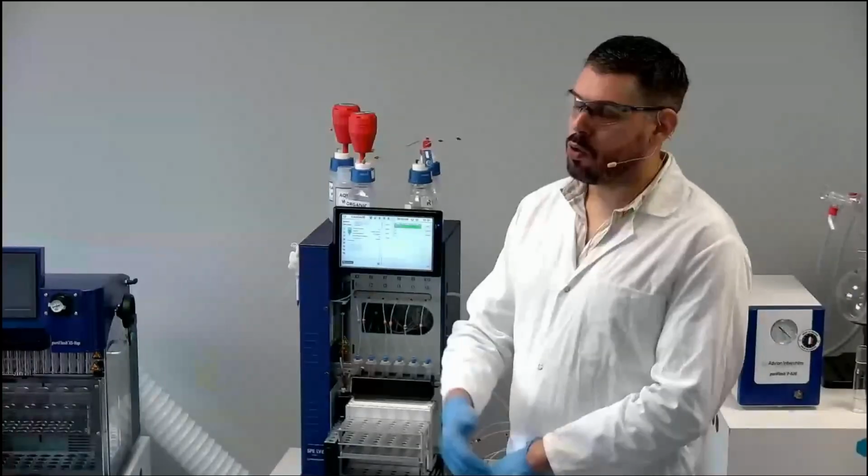Okay, great. Thank you. The next question is: are the adapters for SPE columns, 1 milliliter, 3 milliliter, and 6 milliliter, compatible with all SPE column brands? Yeah, it's compatible with all SPE brands. So all the brands of SPE that you can find in different laboratories are available.